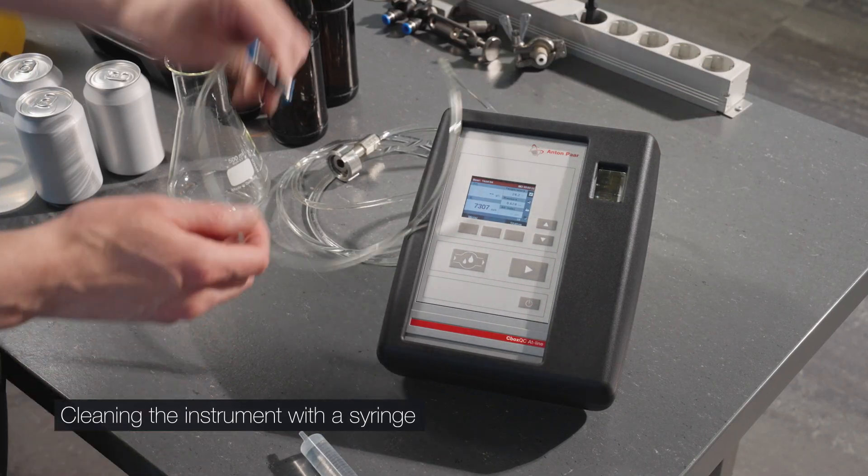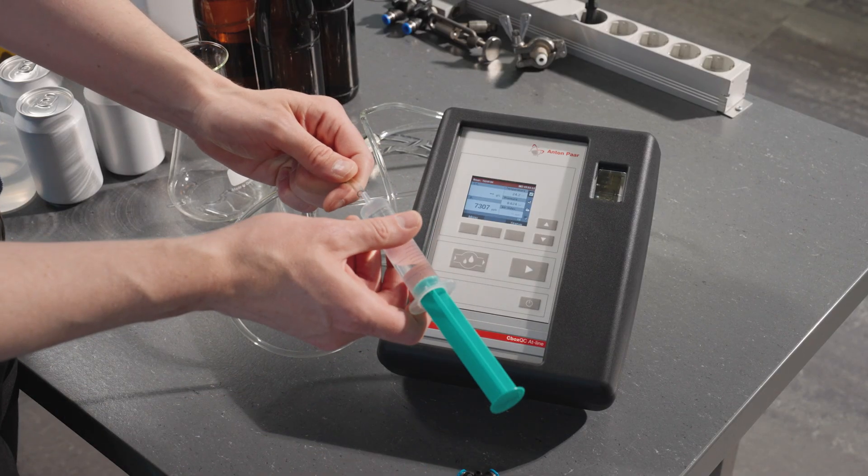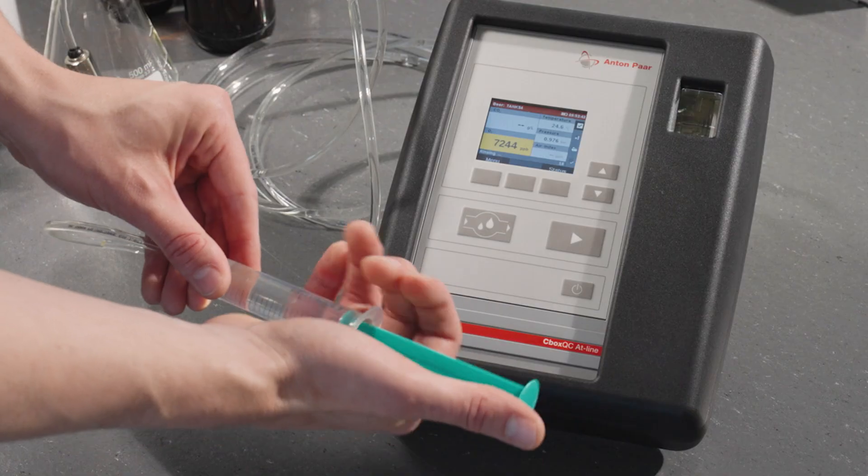The instrument can also be rinsed with a syringe using at least 200 milliliters of purified water after rinsing starts. You can also perform a back flush with a syringe if needed.